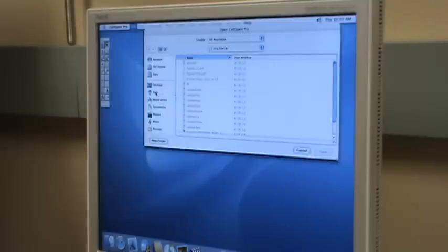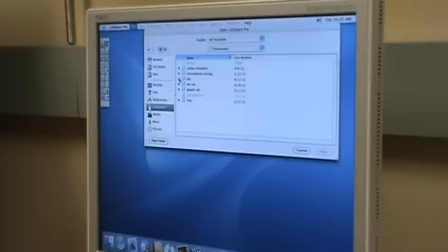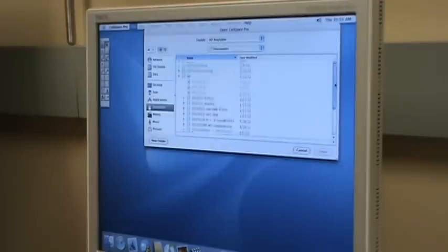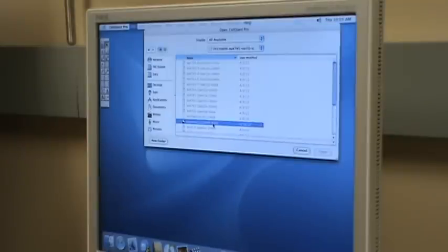I go to my document, my own directory, HQIN, and then I go to Document. Usually you have to find the lab template. You find the most recent template. So in our case, I'm going to find it looks like Apple 9. This one, this template.